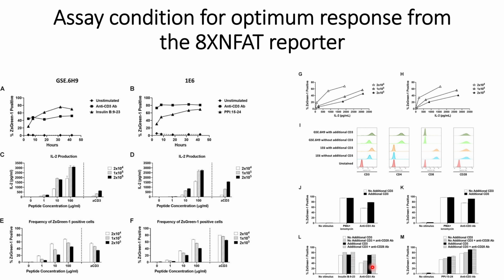But when they use anti-CD3 antibodies, in that case the signals are high with the addition of CD3 antibodies, and also slightly higher with the use of anti-CD28 antibodies. And they have seen similar results for the T cell activation using 1E6 receptors.